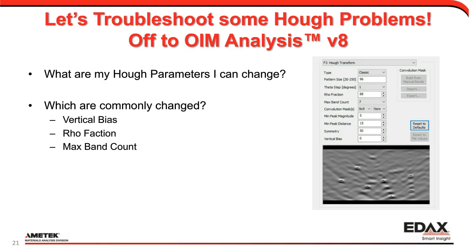I'm not going to have slides on these later on, because again, they're not used often enough to really spend that much time on. Things like the pattern size and the binning is just something, honestly, I don't change. Back in the day when computational time was more important, the Hough was your limiting factor. So you would bin the Hough down to match your patterns, and from that you would save computational time. I just don't run into that as my choke point anymore.